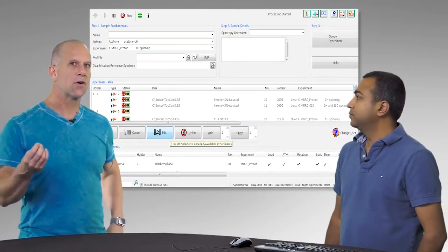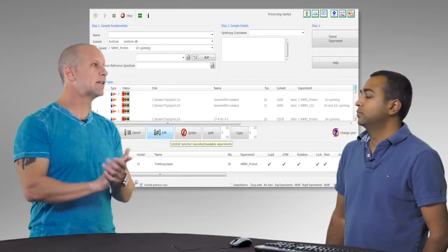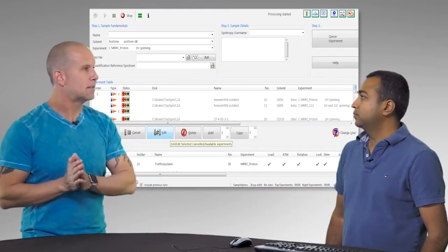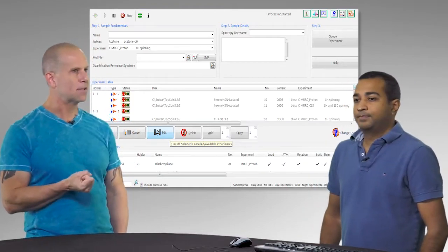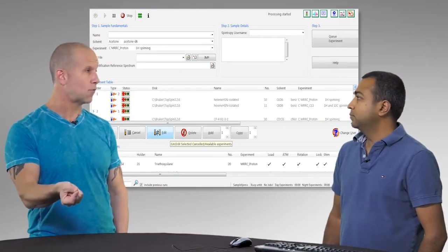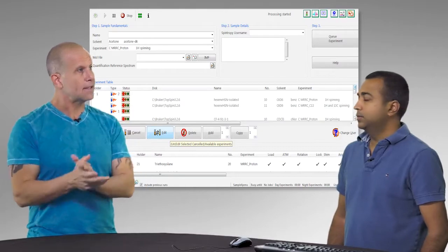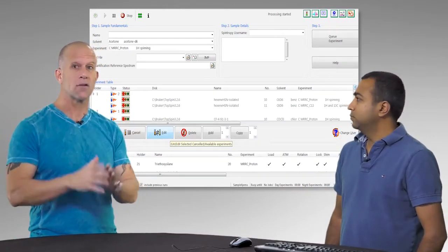And this would be true for research students, educational students, even remote students who are having their samples sent. Basically, we're having somebody enter this into the automated system, and there's really two components to this. One is sitting on the instrument directly, running Bruker's software, which they have, IconNMR, as a completely separate package for this automated service. And that's what we're going to look at first.